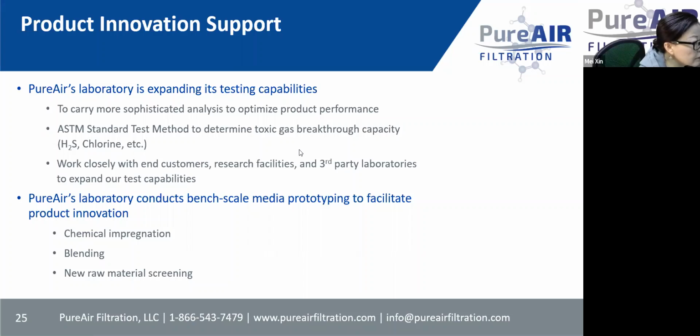The first one is: is there a difference in testing blends versus 100% potassium permanganate? I assume the blends you're talking about are blends with different Pure Air products with active carbon. Since the permanganate is the active ingredient, we separate the product from the carbon in the blends, just like I said before, and we do extraction and test the blends. So it's the same testing methods, but different sample preparation methods.